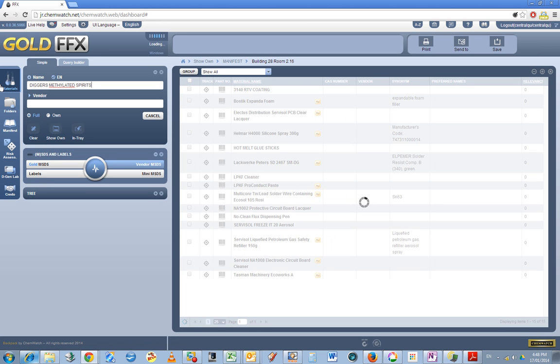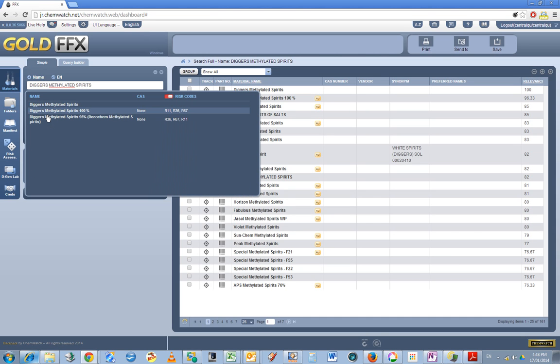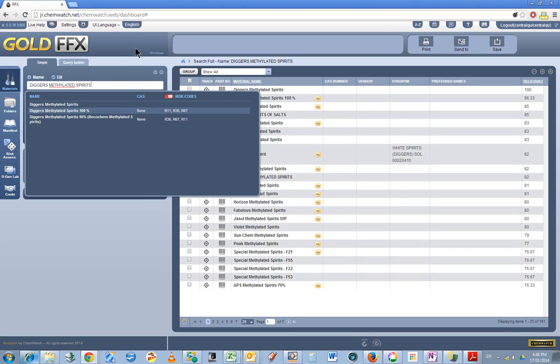By the way, when I first did this search I had the option 'own' activated, meaning that it would search MSDS sheets already in our own folder system. So basically I had to switch it to 'all' to find the sheet that I was looking for.